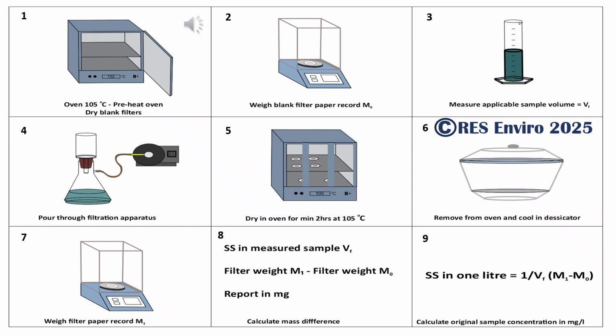When all the water has been evaporated from the solids residue and filter, the dried filter is weighed again to record the dry solids filterable mass, slide 7. The difference in recorded mass for the filter measurements is the dry solids for the volume of sample used, which must be converted to a milligram per liter value, with the calculations shown in slides 8 and 9.